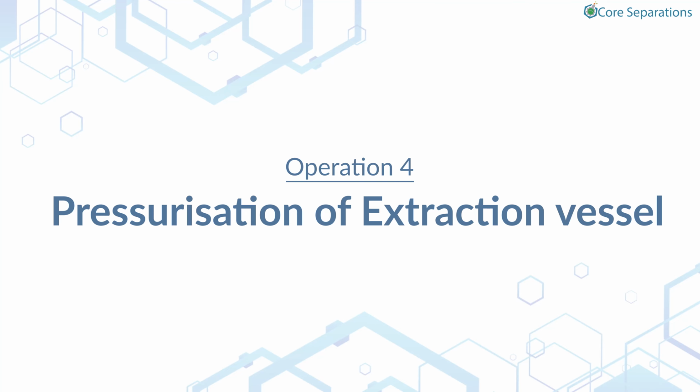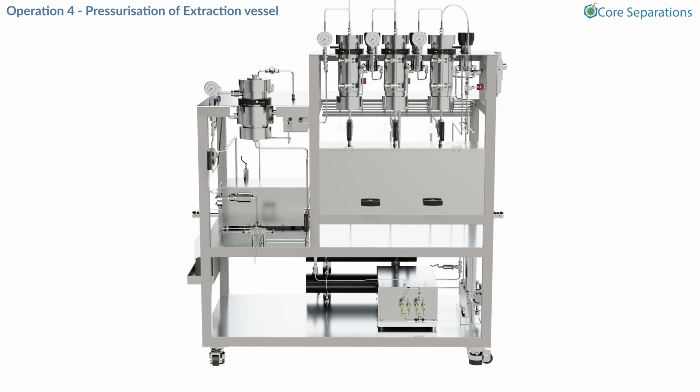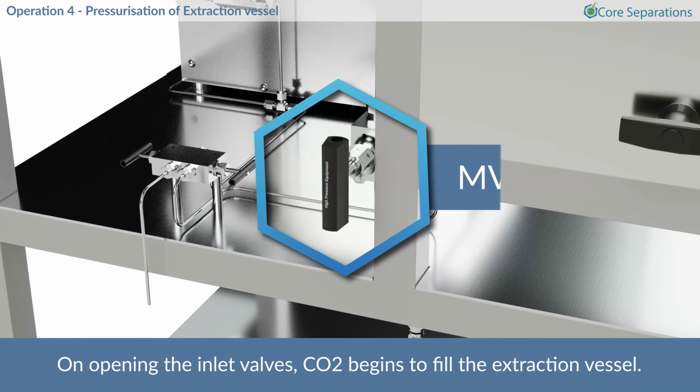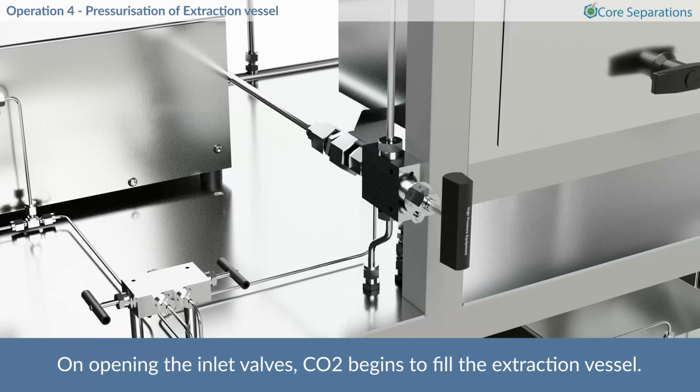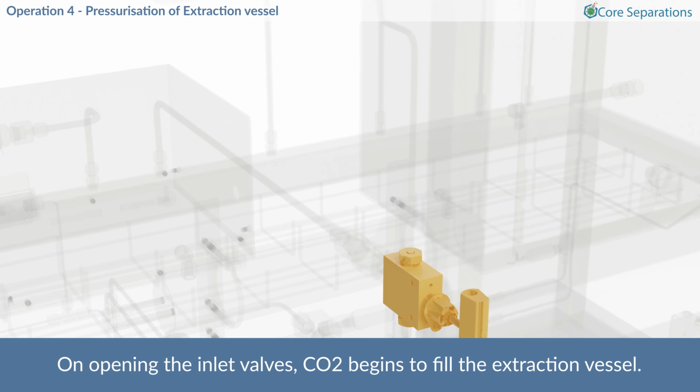Operation 4. Pressurization of the extraction vessel. On opening the inlet valves, CO2 begins to fill the extraction vessel.